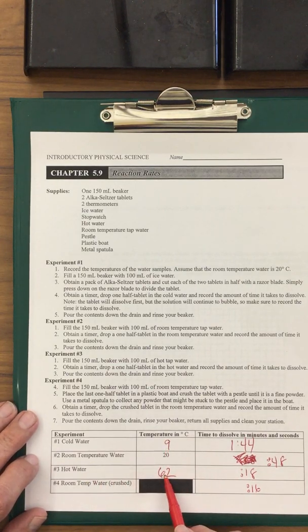We also did it in hot water. The temperature was 62 degrees Celsius and it was very, very rapid. It was 18 seconds. Remember, the higher the temperature, the faster the molecules are moving, so this makes sense, the time would drop. Now, the room temperature one should probably be in between 18 seconds and 1 minute and 44 seconds, and it is. So that's what is expected.